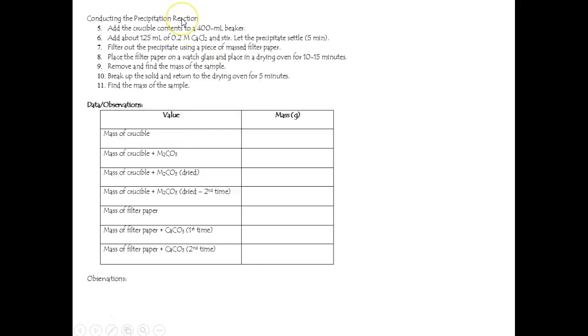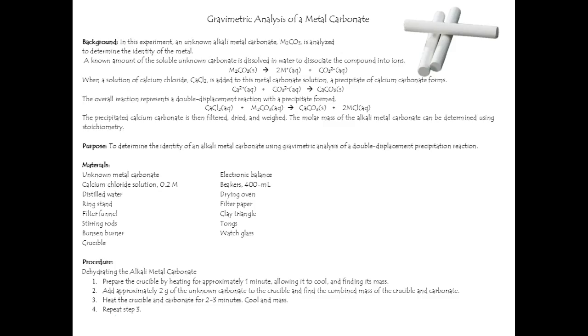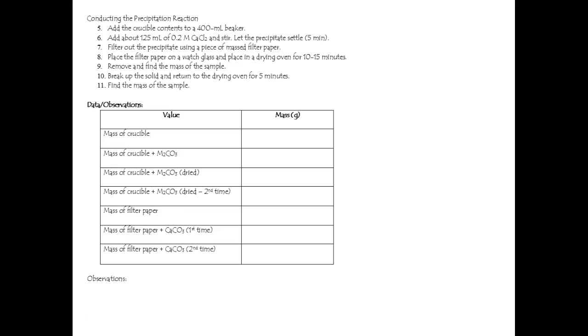We'll then do the precipitation reaction where we add the calcium chloride. It should precipitate out the calcium carbonate. That's the same product for everybody, but you will get different amounts depending on what you started with, since these react in a certain molar ratio. And I want you to take a nice close look at the balanced chemical equation to see if we are dealing with a 1-to-1 ratio. Give some thought as to how the stoichiometry of this reaction is important.